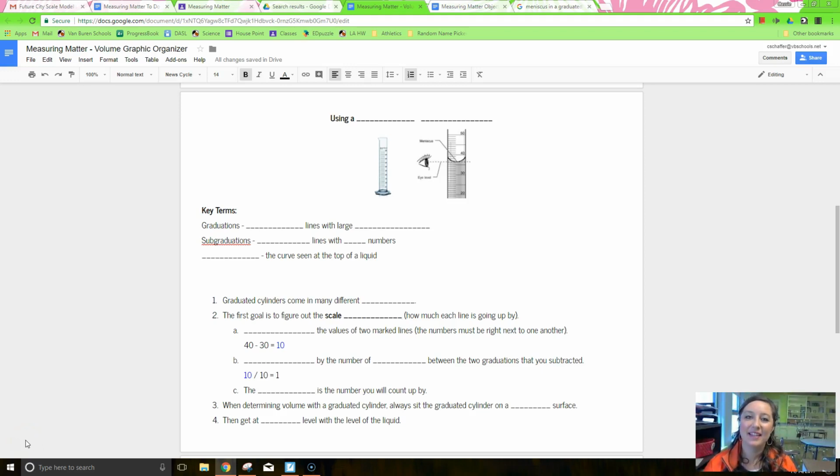Hi, sixth grade. This video is going to all be about the tools that we're going to be using with measuring a liquid. Now, we already focused on measuring the volume of a regular solid, but that's not going to help us a whole lot with our recipes. You should have been telling yourself, okay, I'm not really going to be putting perfect blocks of ingredients into my recipe. So finding the volume of a solid isn't going to help us with our big problem.